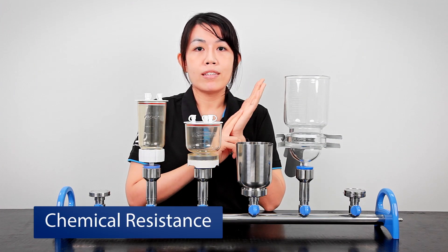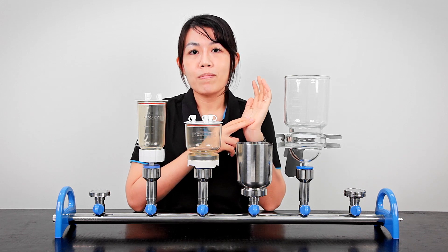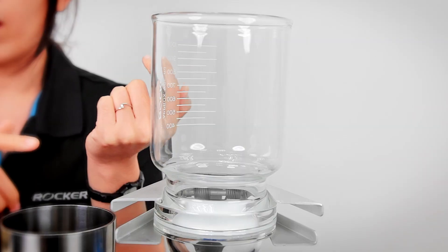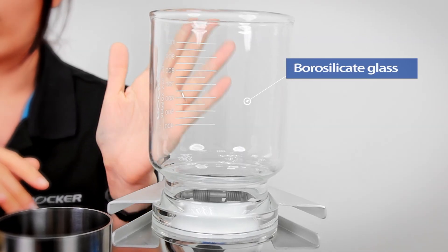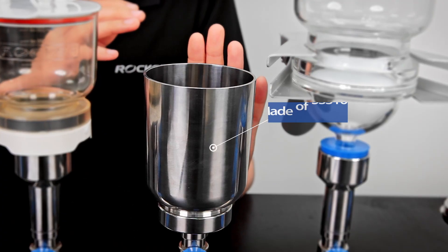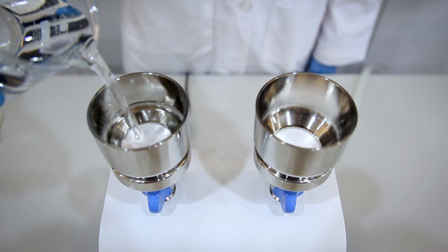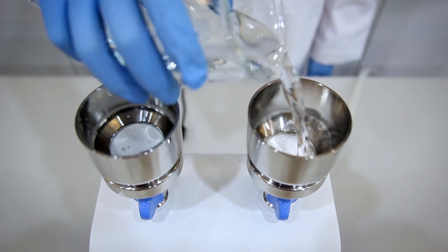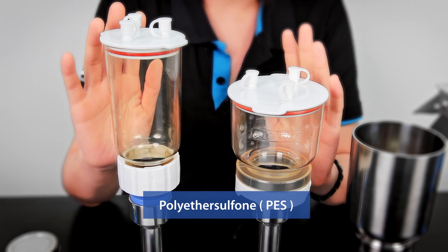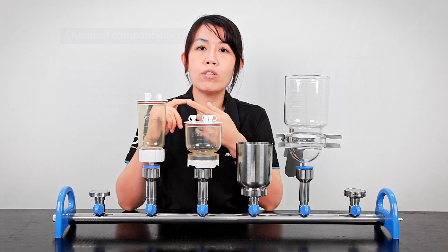The second thing to consider is chemical resistance. You won't want the funnels to be damaged after just a couple of uses, especially when dealing with corrosive samples. In that case, the first place goes to the VF collection, made of borosilicate glass, which can handle most chemicals. But that's not the only choice — we also have the SF collection made of 316 stainless steel, which is highly resistant to alkaline solutions, though it may not be ideal for acids. As for the MF and LF, they are made of polyether sulfone, known as PES, and are resistant to some solvents. If unsure, always refer to the chemical compatibility charts.